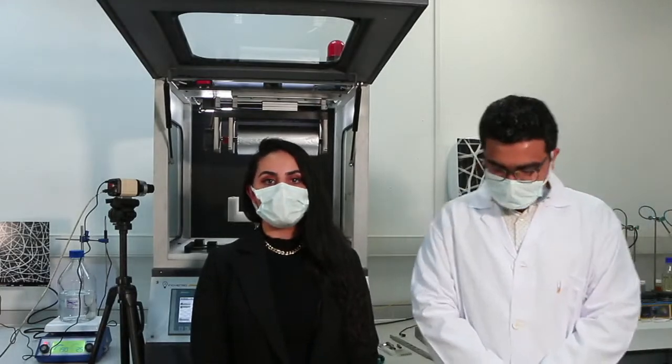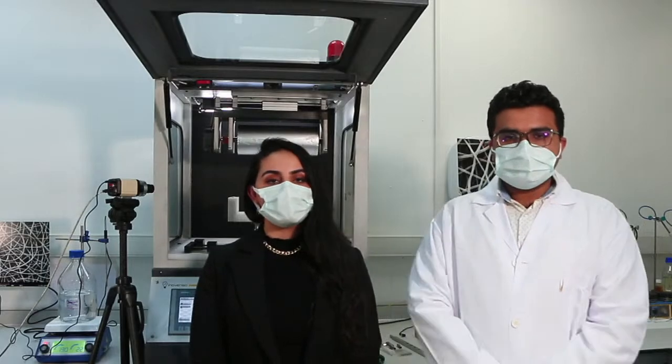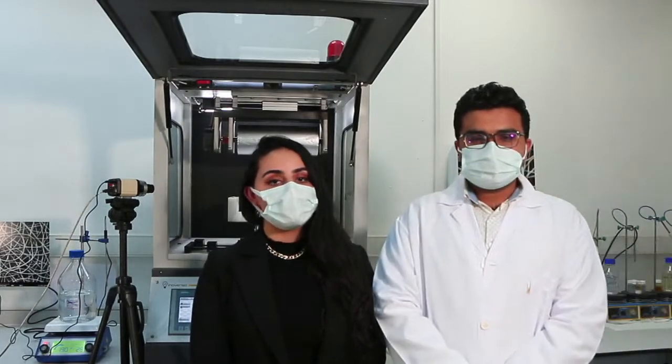Today we will talk about the basics of electrospinning. We are here to give you information about electrospinning and electrospraying technology. Firstly, we will look at the basics of electrospinning technology. Then we will discuss the process from polymeric solution preparation to nanofiber production. Then we will learn post-treatment and characterization methods. And finally, we will address all of your questions.